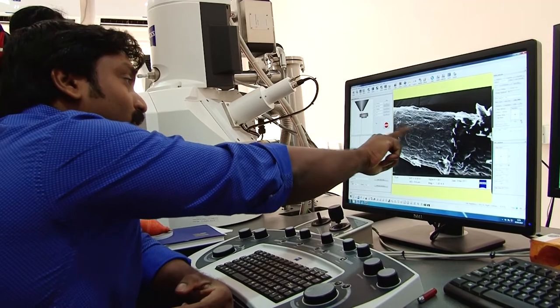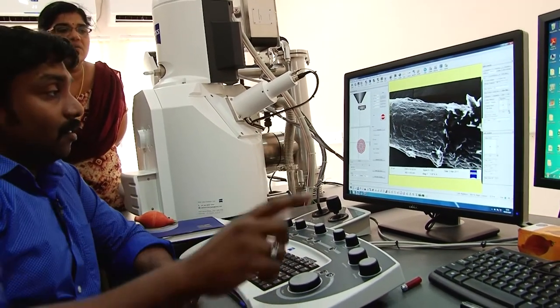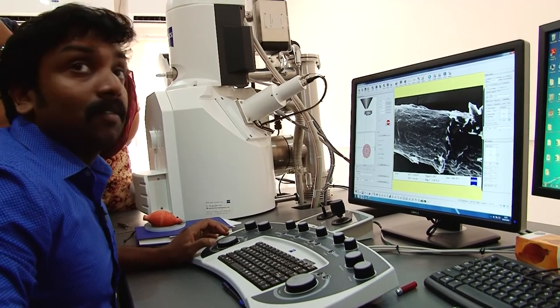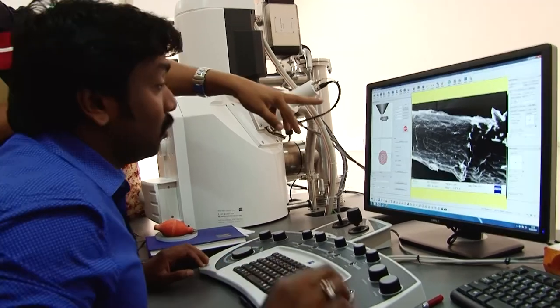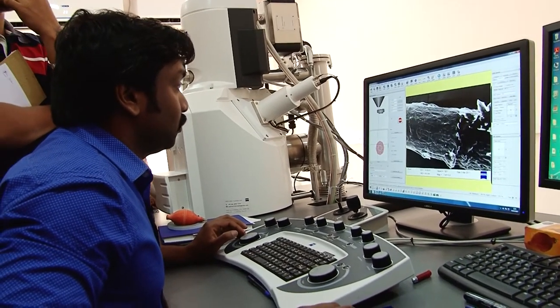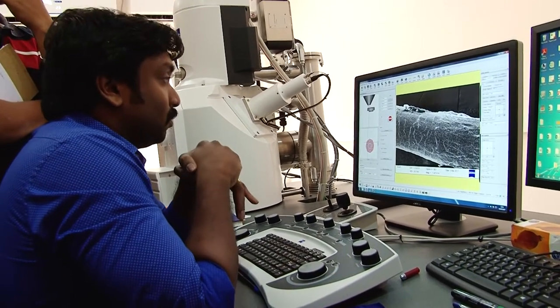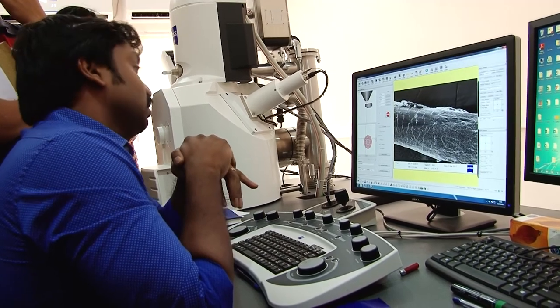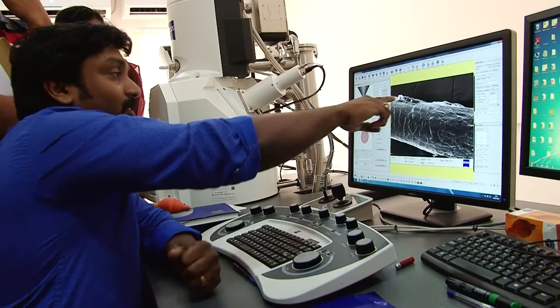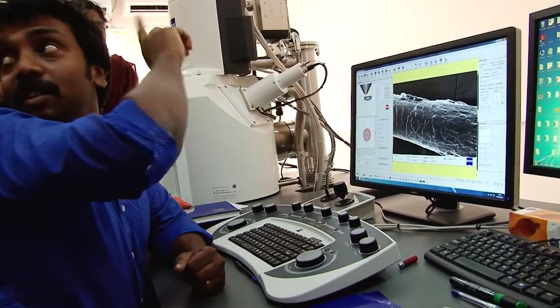This is the root, the root and the portions attached to it. Pardon? Maybe this hair is having some kind of damage. See this portion. But the normal structure will be like this only, same one.